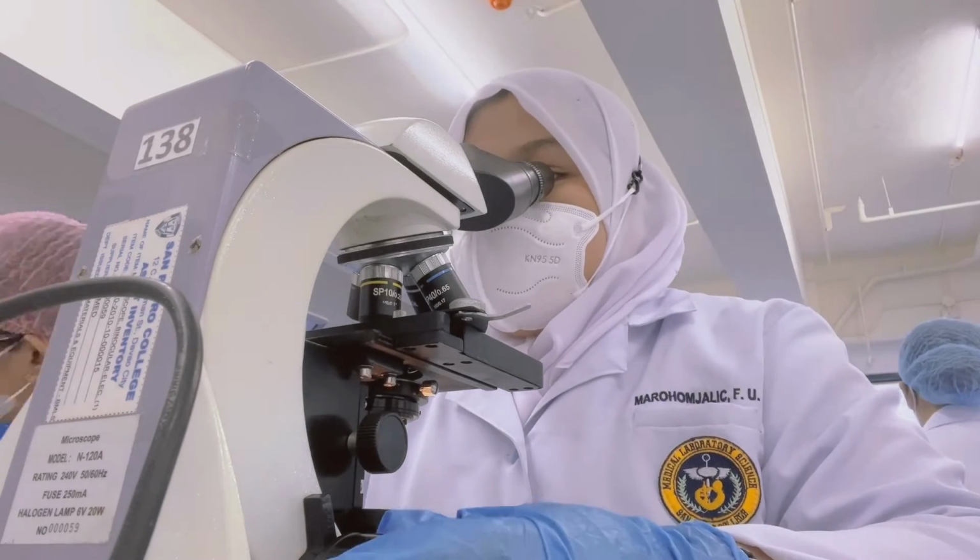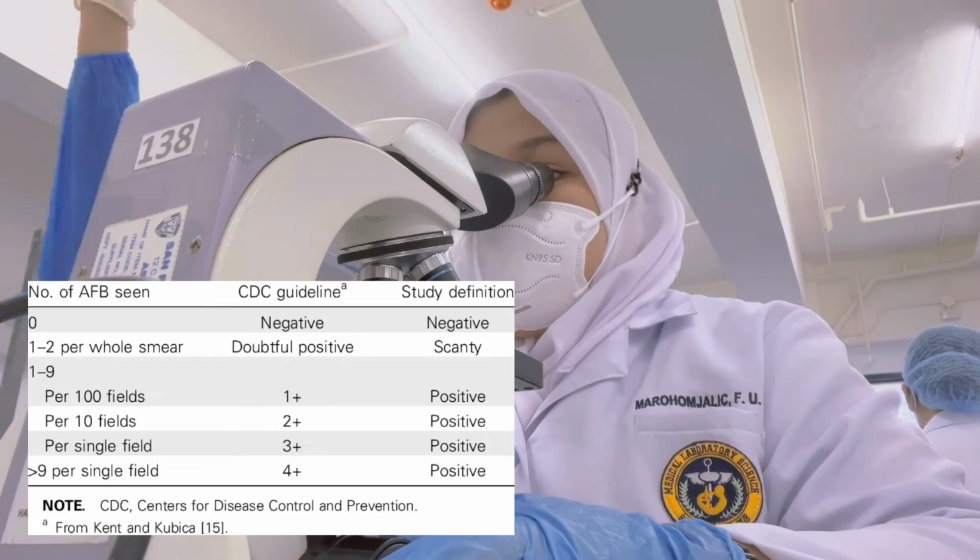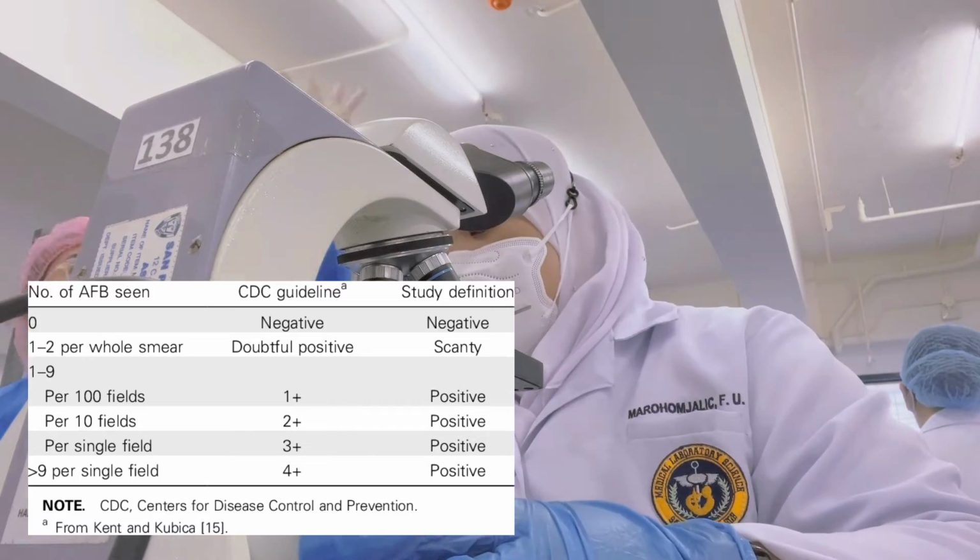Once the slide is dry, it is now ready for reading. For grading, follow the criteria shown.